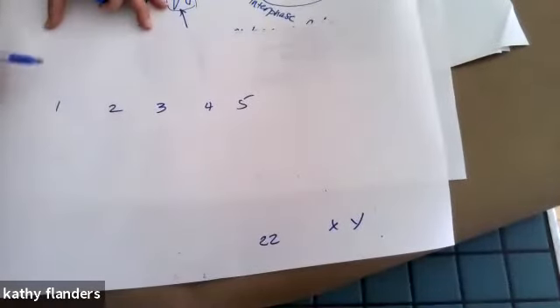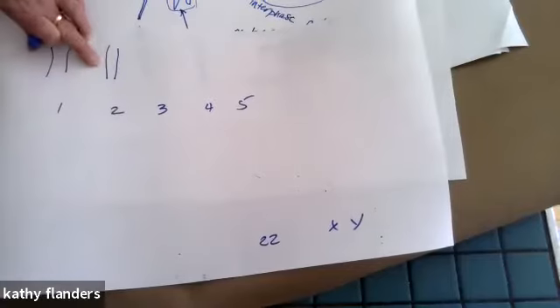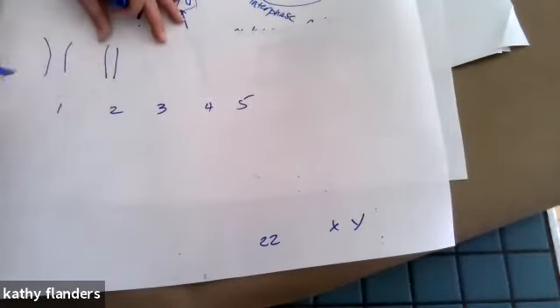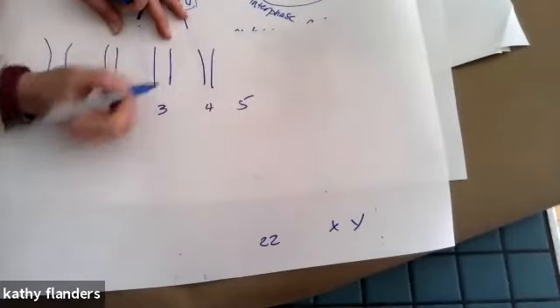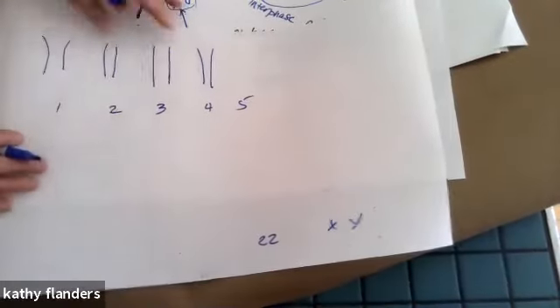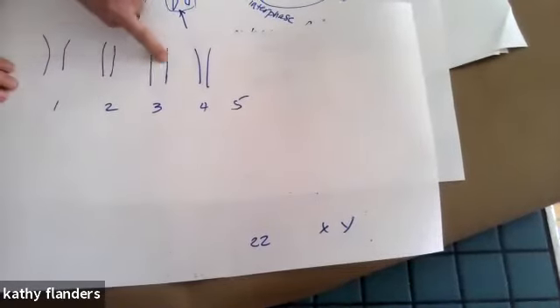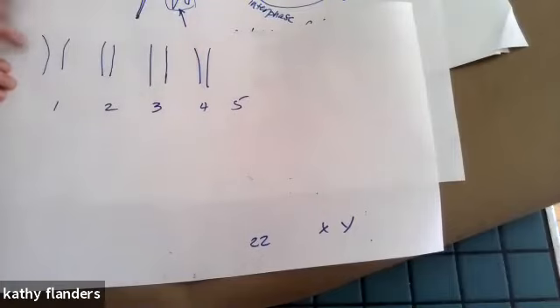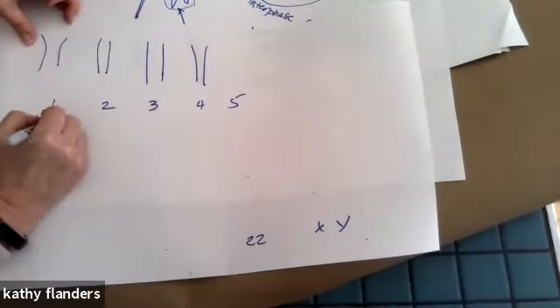And it showed that we had a chromosome from mom and a chromosome from dad, and we had a second chromosome, chromosome number 2, one from mom and one from dad. They were about the same size. They had darker portions and lighter portions. So this is a diploid cell. There are 2 copies of each chromosome. That's called diploid.